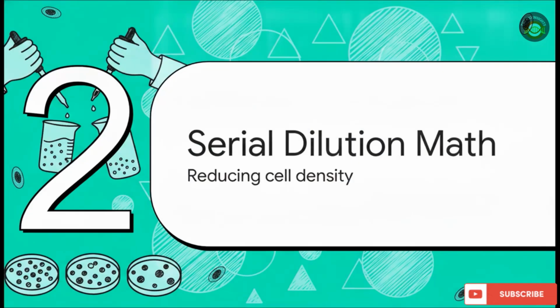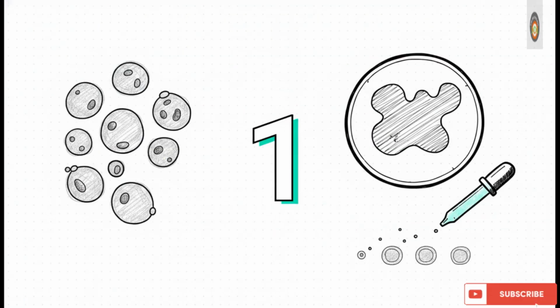Moving right along to Section 2, the math of serial dilution. Well, by solving our first problem, we've actually gone and created a second one. Once incubated, the cells are incredibly dense. To put the scale into perspective, microbiologist Dr. Monica Oli looks at Saccharomyces cerevisiae. That's your common baker's yeast used for bread and brewing beer. Her ultimate goal is to find out exactly how many yeast cells exist in just 1 single milliliter of her sample. But here's the catch.